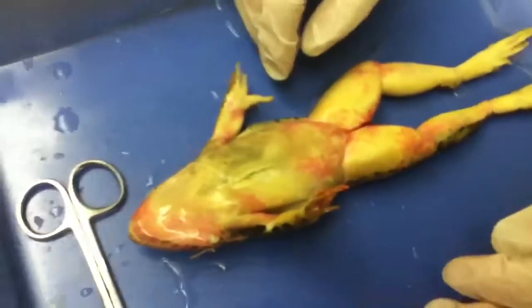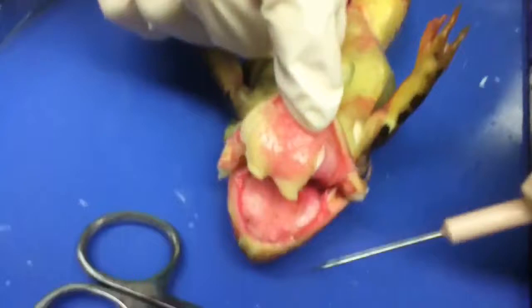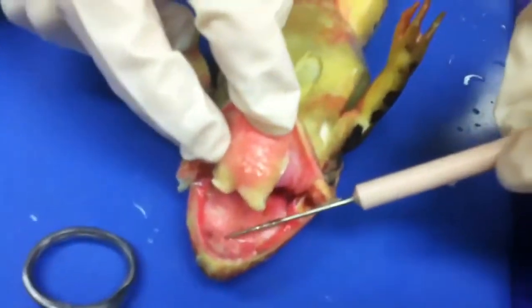Ew. Alright, we have 2 more questions before we can cut his legs. A frog does not chew its food. What do the positions of the teeth suggest about how the frogs use them? These positions, because of the teeth, how it's up here and how it's like sandpaper, I think it's just because he sucks on them. But then there's these 2 teeth that are like really tiny.